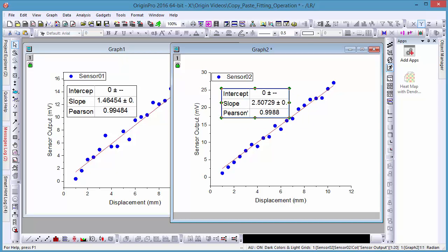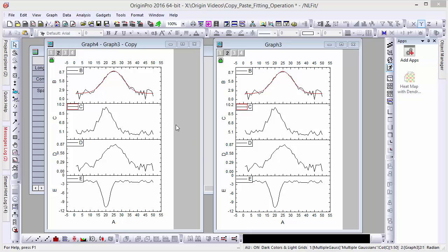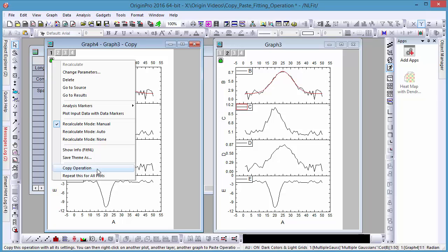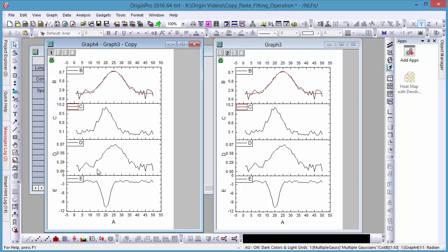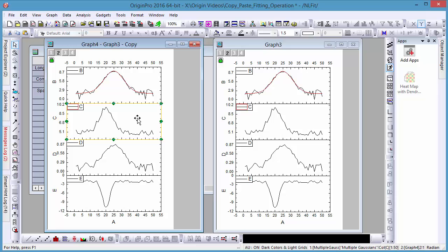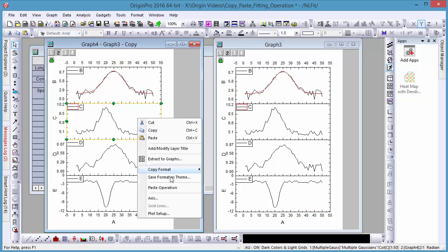For multi-layer graphs, such as this multi-panel graph, users have the option of pasting fitting operations to one panel or all panels. To paste to only one panel, right-click within said panel and choose Paste Operation.